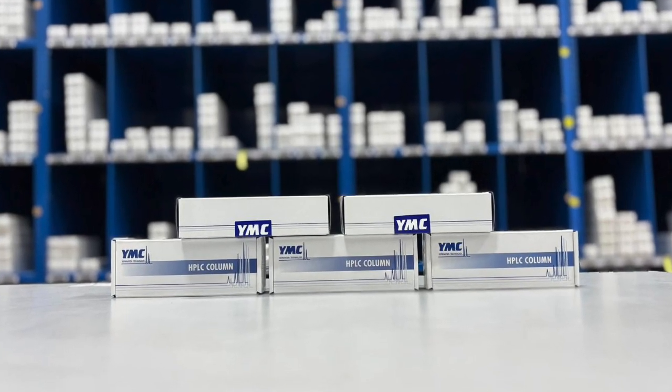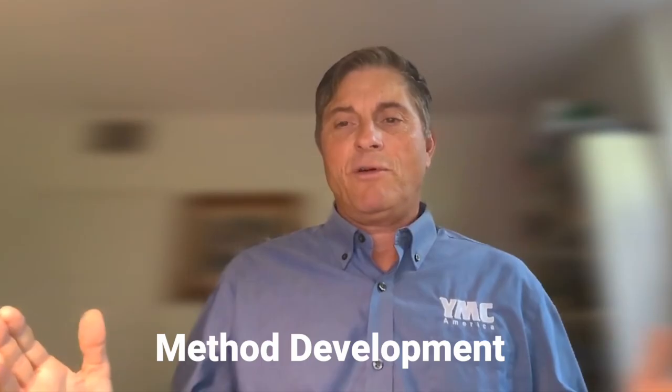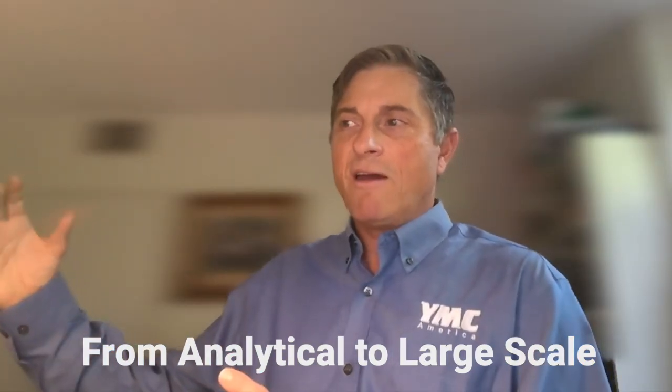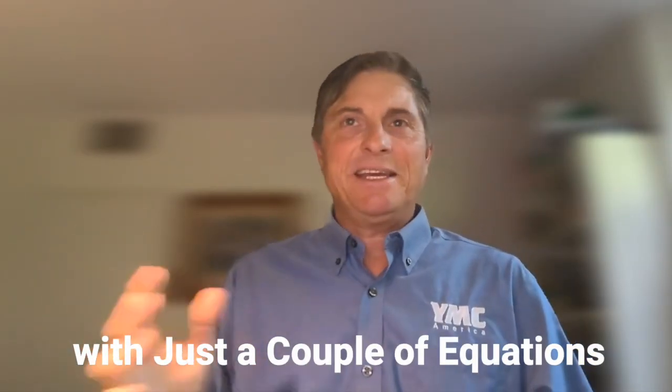You can develop a process in a small analytical column. For peptide, we have about 12 different stationary phases, and then you have your method developed. And what's amazing, you can scale up from virtually an analytical scale to a larger scale with just a couple of basic equations.